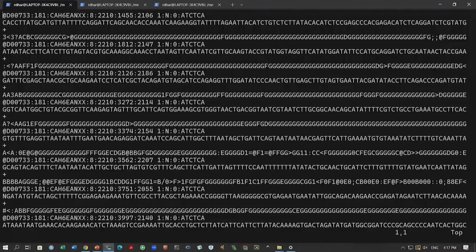So, let us go back to the first line, and one of the things you might be wondering is whether we can write anything on this file. To do that we have to go into the write mode. Before we go into the write mode, if you are just interested in read mode, for example with FASTQ files, we do not want to write anything, so we just want to come out of that file.